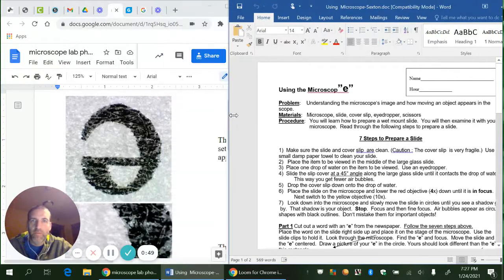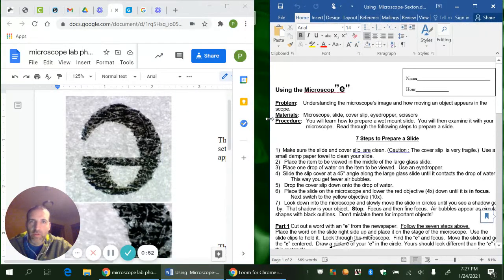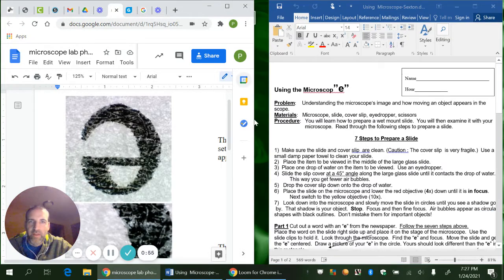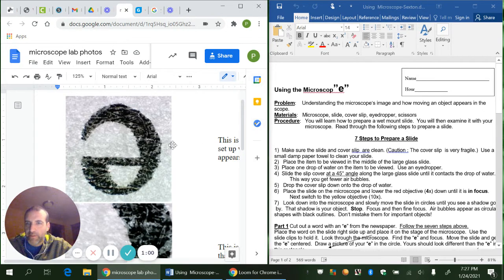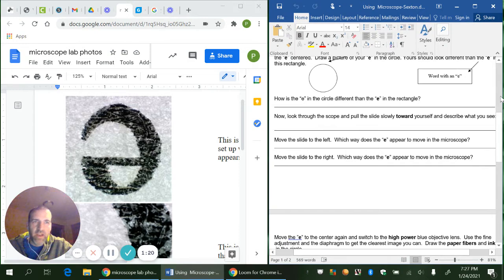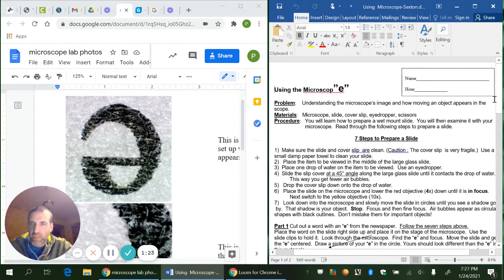So the purpose of this video was for you to get a chance to use a microscope for the first time. I know that this is not ideal. And I'm sure that later in your school career, 10th grade, maybe even next year, you'll get a chance to use a microscope to look at some rocks next year, possibly. But if not, in 10th grade biology, you'll definitely get a chance to use these. If you have used a microscope before, this may be a little bit of review. If you have not, this is just going to be a chance for you to get a little bit of an idea of how they work.